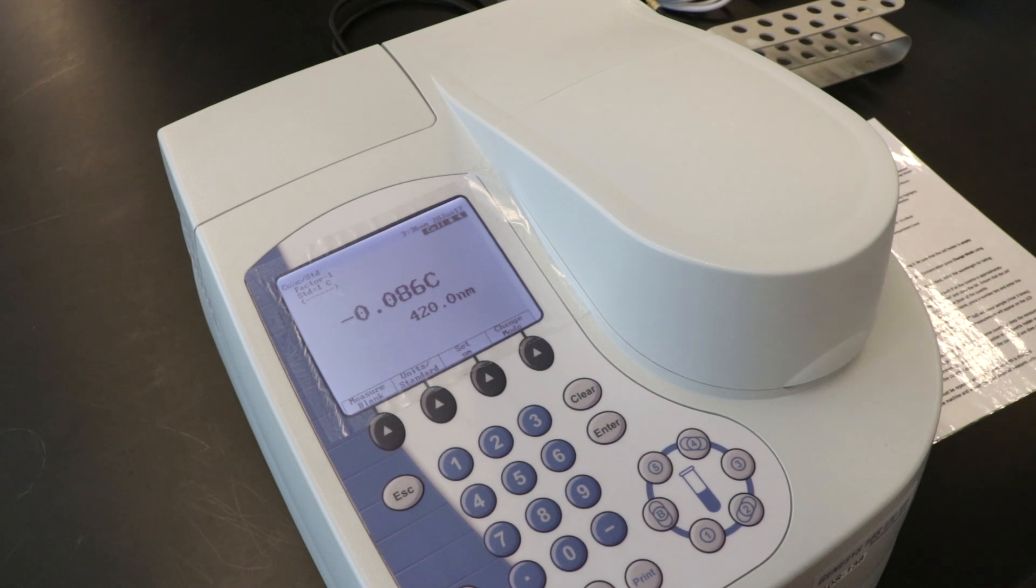In your notebook, record the value for absorbance if you're using a digital spectrophotometer or percent transmittance if you're using an analog spectrophotometer. Repeat this process for flasks 2, 3, 4, and U.